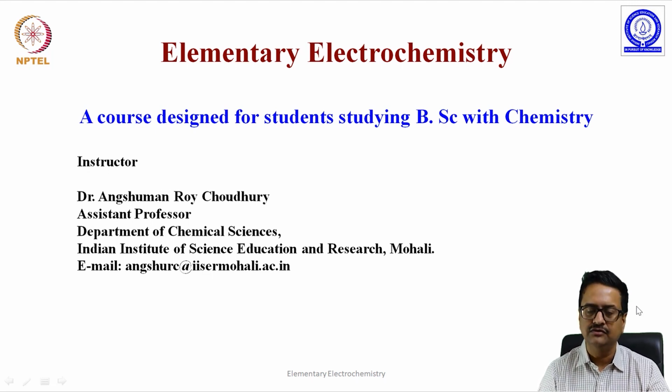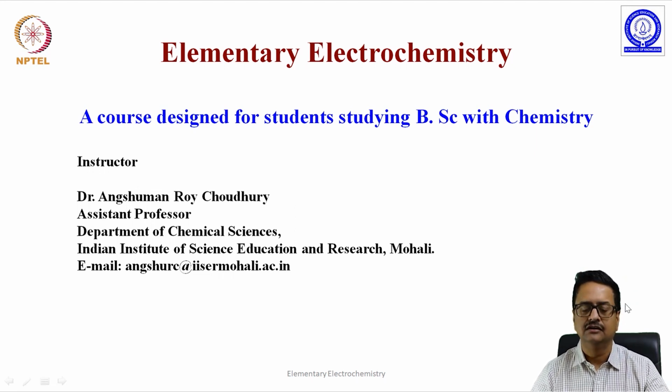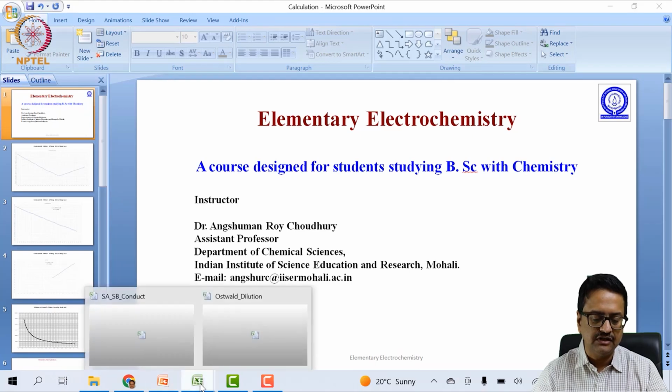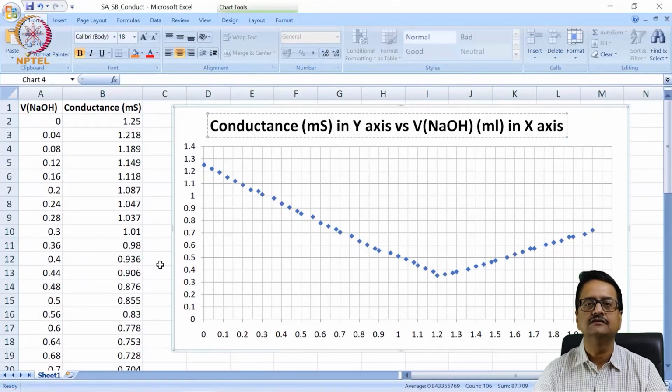And in today's lecture, I will discuss the calculation part and how to draw a graph plot for those experiments, and then I will show you how you can calculate the endpoint of those experiments. So before going into the presentation, I want to show you the data.